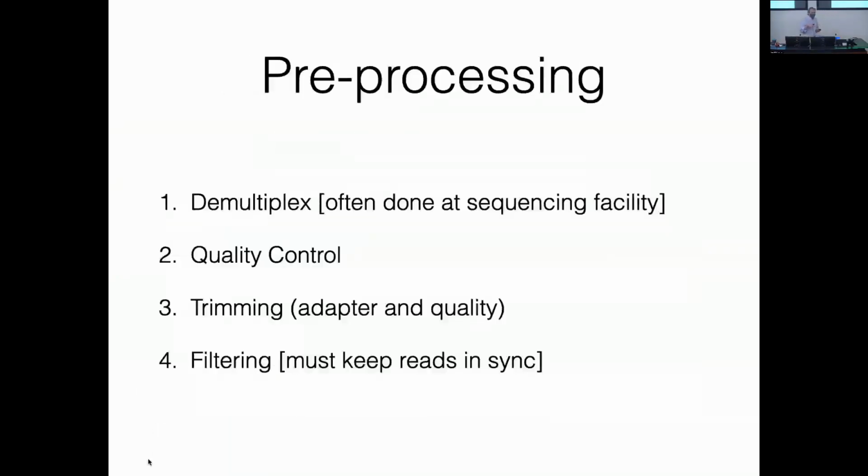These days, it's pretty common that demultiplexing actually gets done on the sequencer. Or if you aren't doing the sequencing yourself, if you're sending your samples to a company or a sequencing core, usually they'll give you back the data already demultiplexed. So we're not going to do that today because it's pretty rare that I end up demultiplexing RNA-seq data.